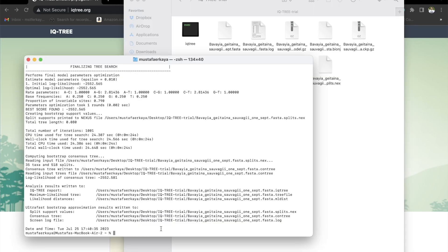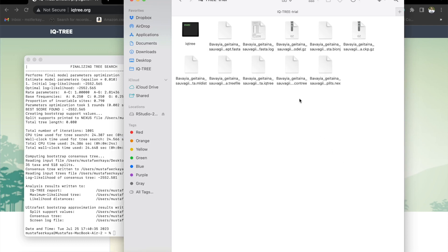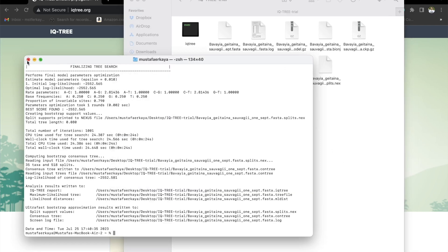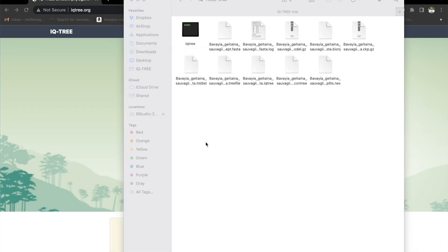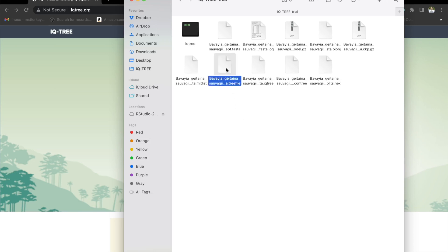As you can see, it's done. What we need to do now is close the terminal screen. We have a bunch of files now. We're going to focus on this one — this is the file we're going to take into FigTree.